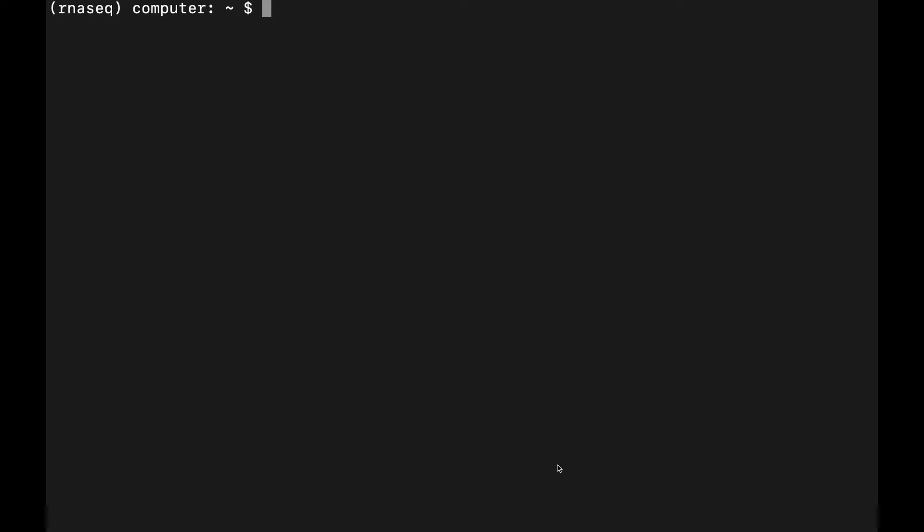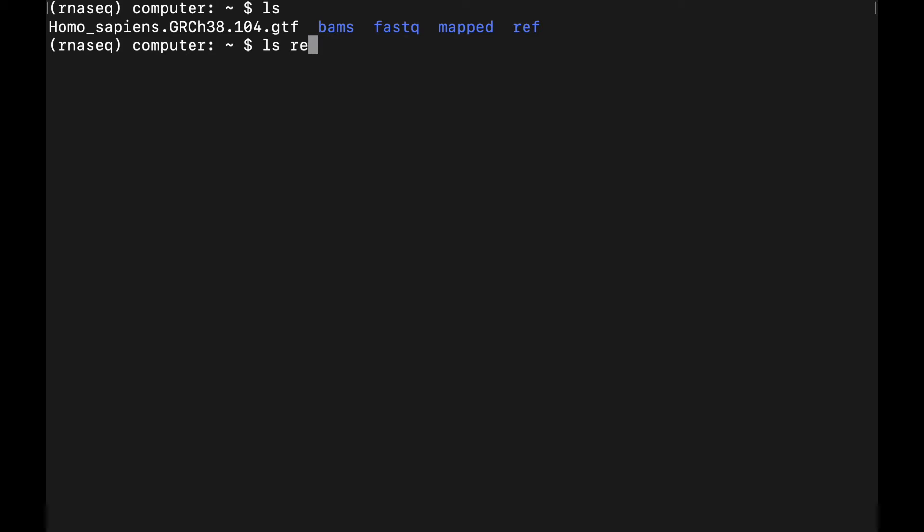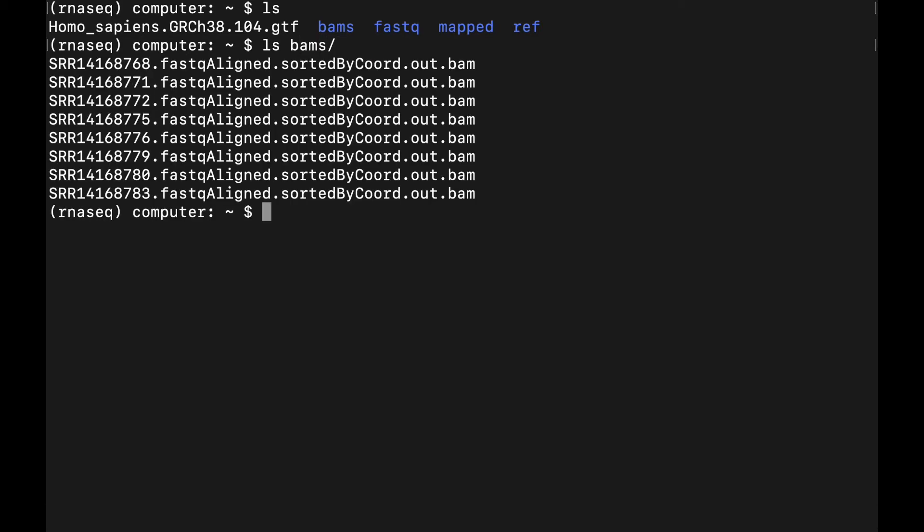Alright, so we need three things to do this. We need the GTF annotation file, which I showed you how to download in the video where we built the star index. We need the BAM files from the samples that we aligned, and we need the actual feature count program.